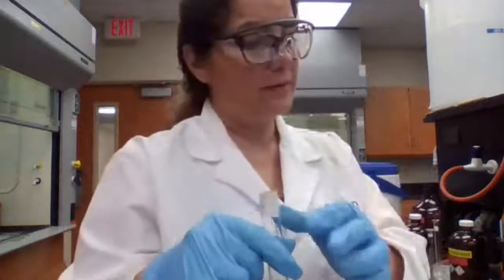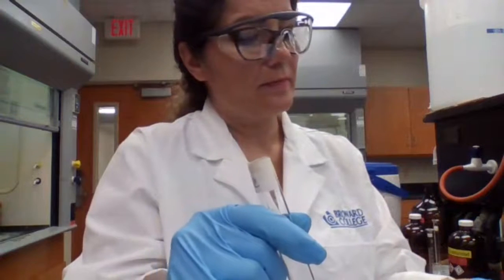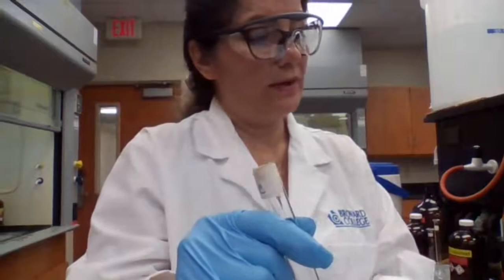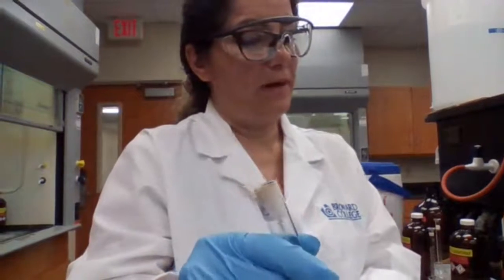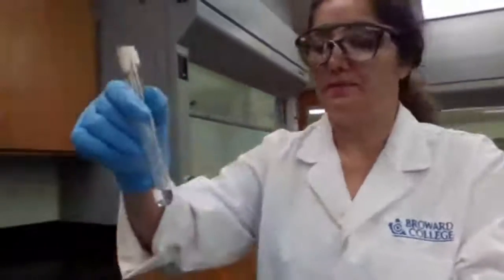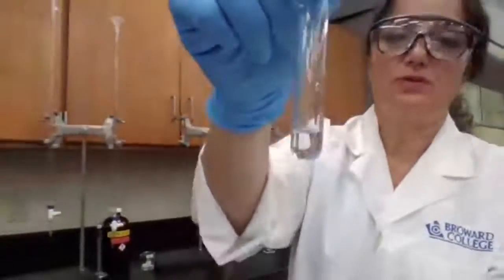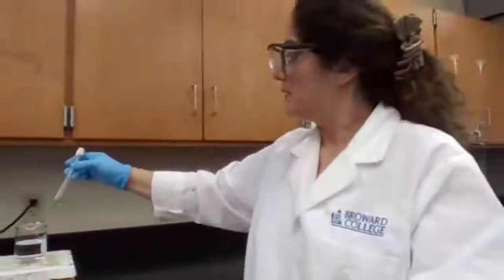Saturated ammonium chloride. And we are going to place it in hot water, in boiling water. So saturated, there's no crystals in there, right? There's no crystals. We place it in a hot water bath.